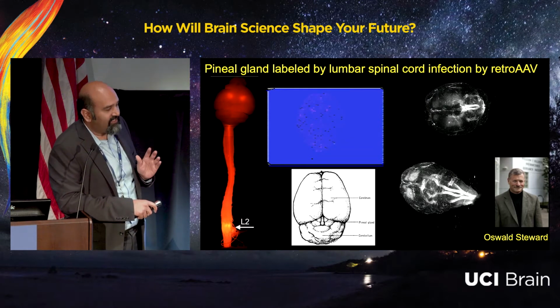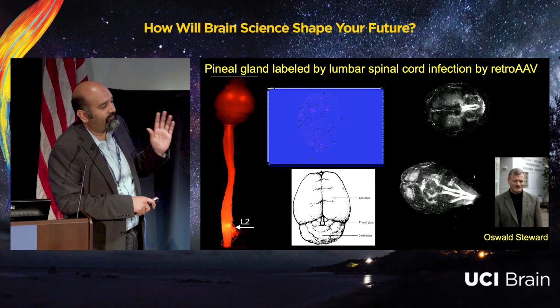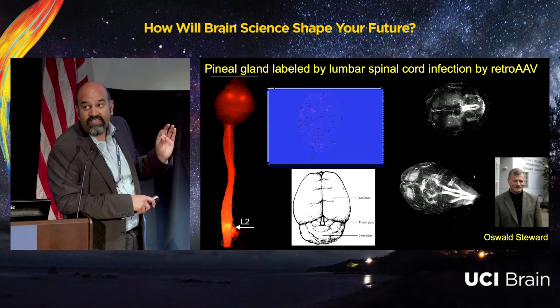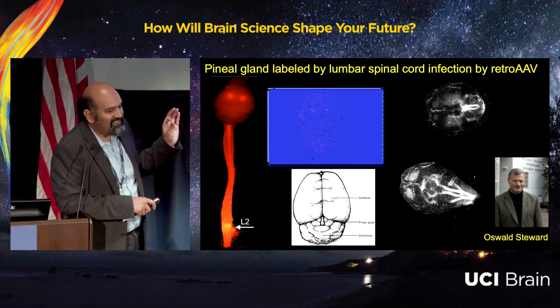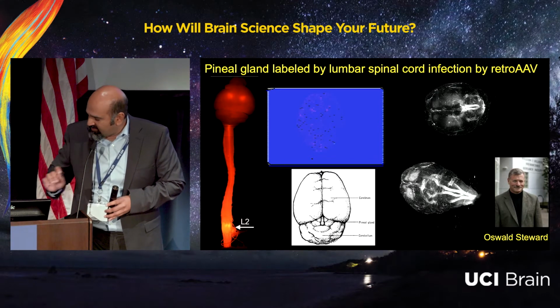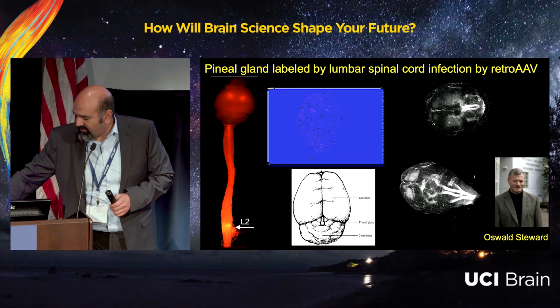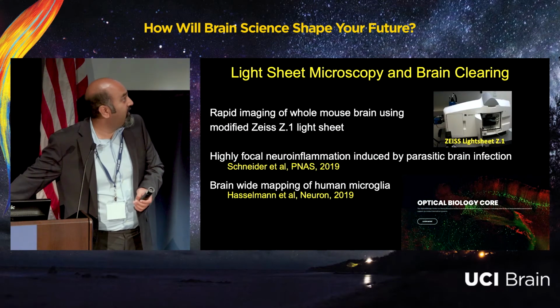It's kind of fascinating because this has incredible implications just alone for AAV viral therapy into the nervous system, if it turns out that there are certain structures that are susceptible to viral infection that you never would have guessed. Anyway, just some of the kinds of things that you find when you're not looking for them, when you start looking at the brain in 3D.